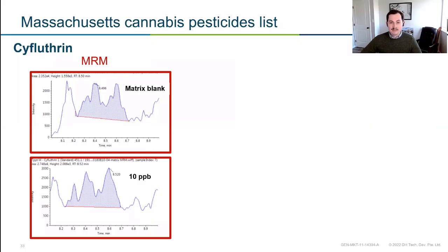One would be in cannabis. Again, cannabis is a truly horrible matrix from an analytical standpoint. And the other would be looking at THC in hair. Another one of my least favorite matrices. It's complicated and it kind of just grosses me out, to be honest. But cannabis is a tough plant matrix. We have high concentrations of cannabinoids. We have all of these plant metabolites. It can be really challenging to look for pesticides in this matrix.